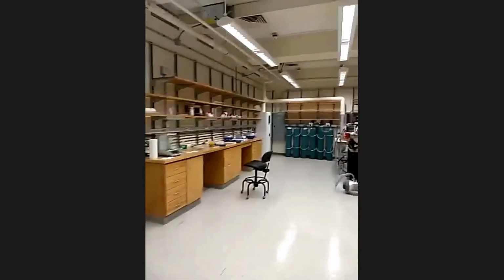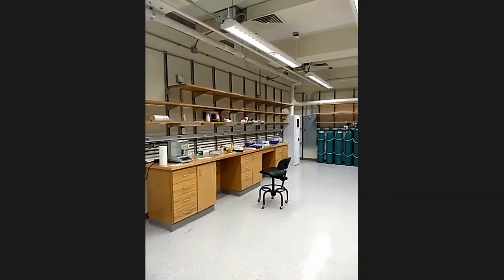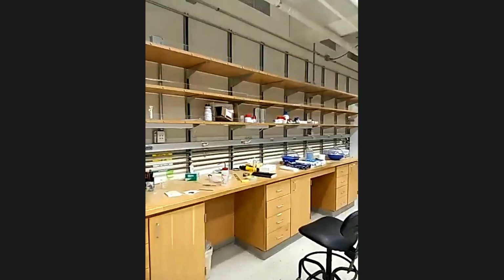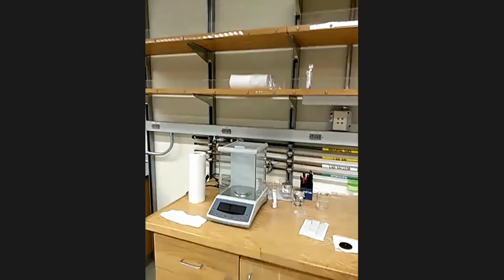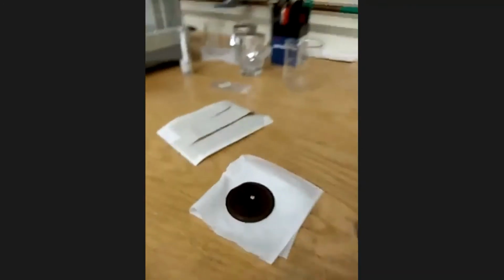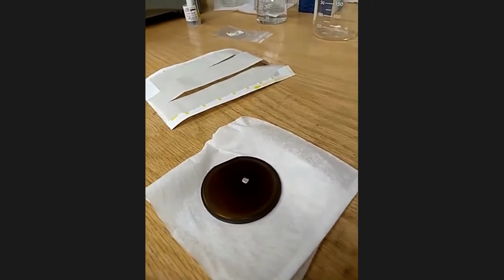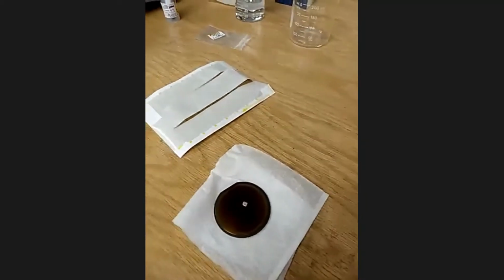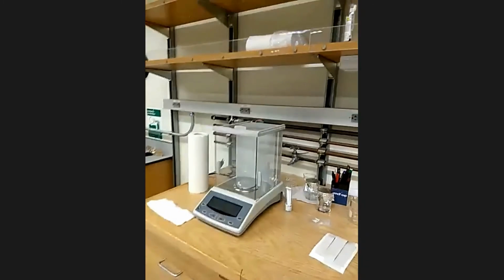So this is our lab. This is one part of it. On the desks over there, we have the powders of the samples, which we measure out in stoichiometric ratios. Right now you can see one of the thin films that we are preparing to create. This is after the deposition. You remember the plume is hitting at a point. That's the thing.